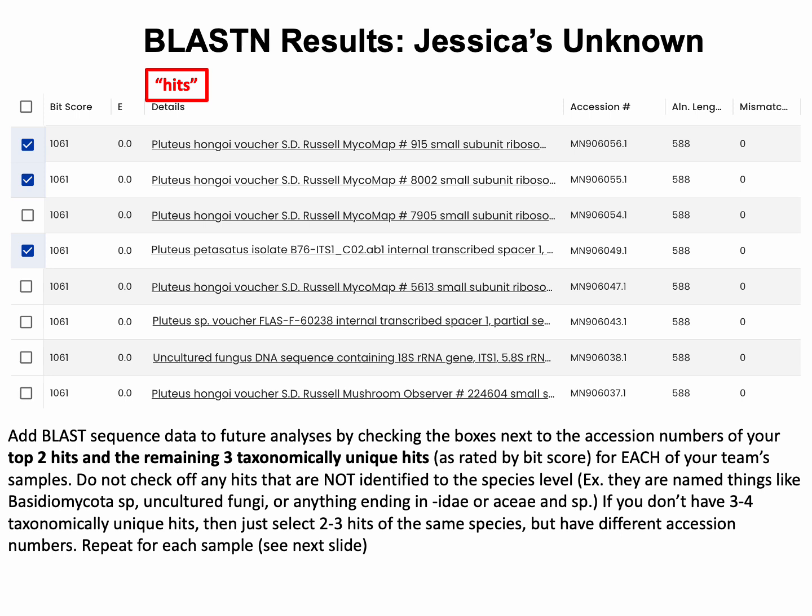So what do you do with all of these hits? Eventually what you're going to need to do is select particular hits to add to your project for downstream analyses. So for example, looking at the BLAST hits from Jessica's unknown, typically what you're going to want to do is add the top 2 to 3 hits that are ID'd to the genus and species level.